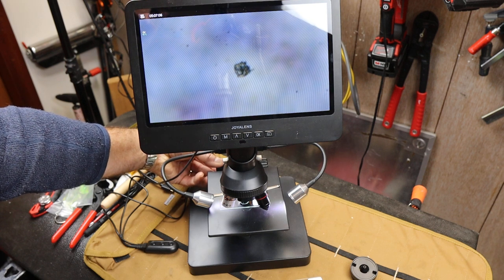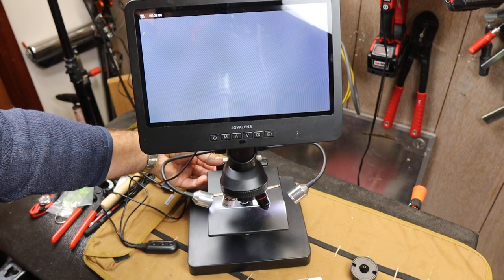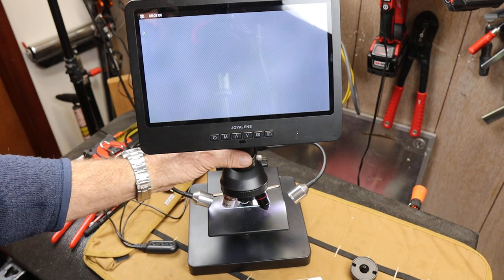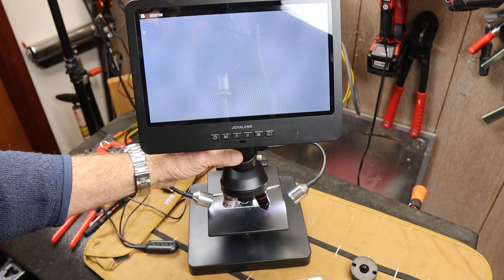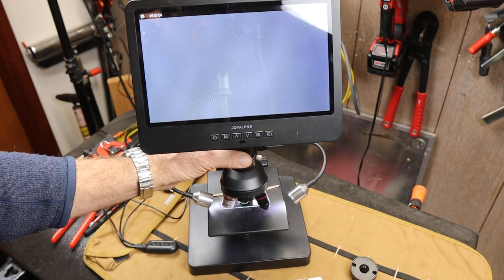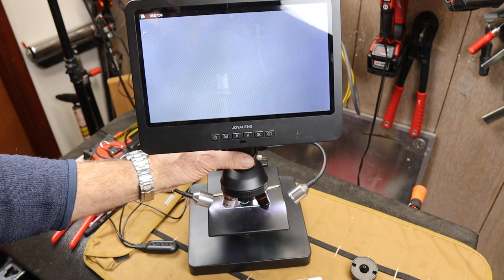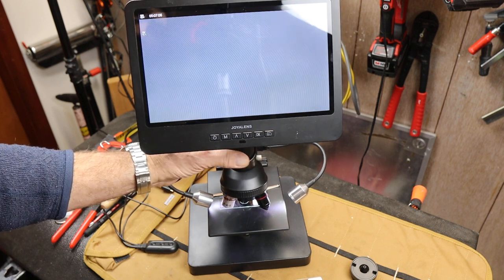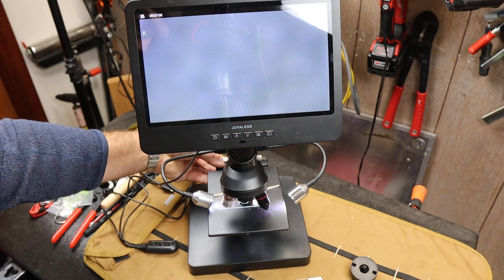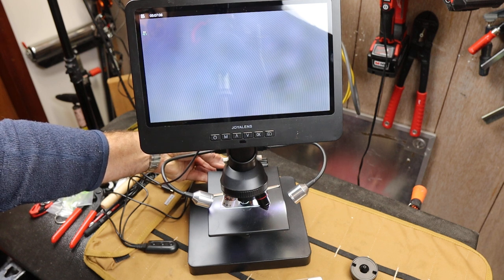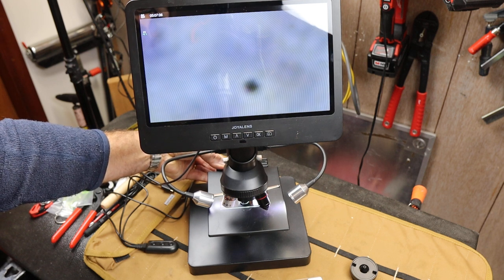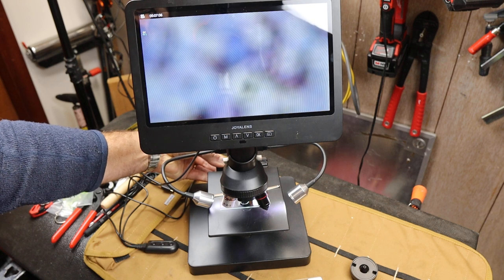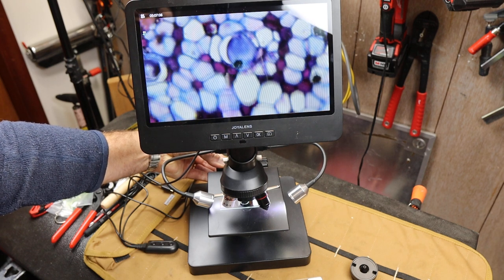There's my slide, and where's my stem? I'm actually watching in a couple different places. So here we go. Get it really close, and then I'll focus in on this. You can see it bounces around.